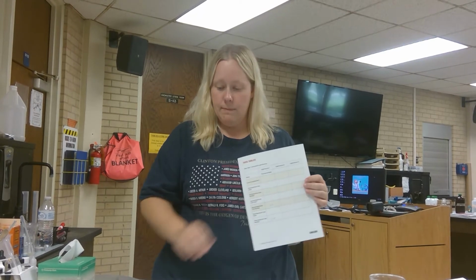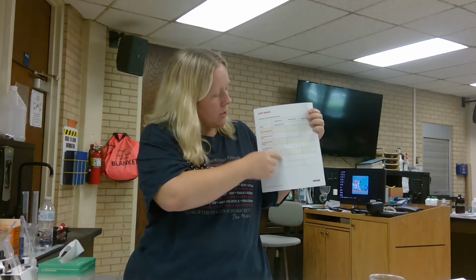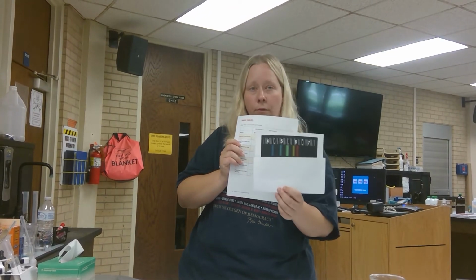Now, I need to know if my spectroscope is calibrated correctly or not. So in order to do the next part, activity 2, I need this column of data right here. If you see more than 3 numbers, like here I see 5 colored lines, write down all 5.